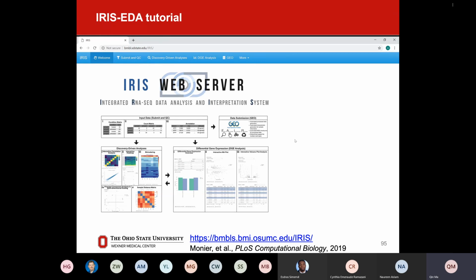So, just a quick review of the other kind of analysis technique. We introduced Seurat. We introduced R Markdown to build a pipeline using Seurat, and then the other computational or enabling technique in bioinformatics is web servers, or web databases. So this is an in-house web server, so-called IRIS-EDA. This one will be introduced tomorrow, also by Cankun, I think.